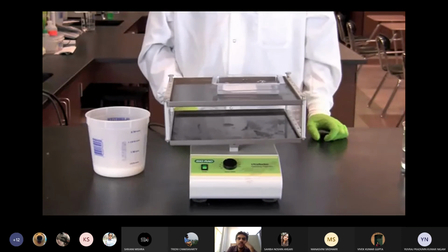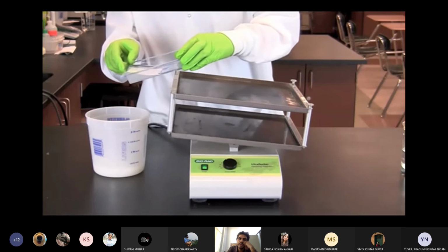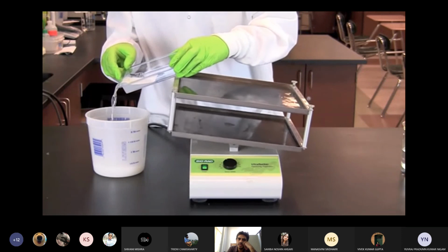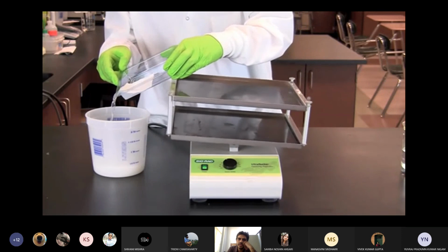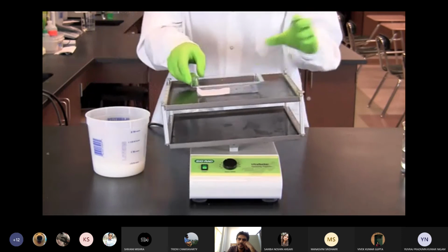After the blocking, you may not need to wash, or if you wish to, you can go for a wash. But after adding the primary and secondary antibody, it is a must to wash. Because if you don't wash, then the non-specific signal may remain on your membrane surface.